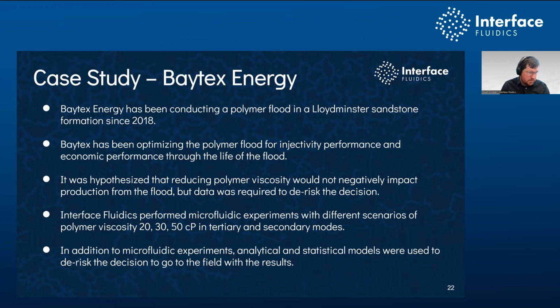The way we customize that is by modifying the pore throat sizes as well as the porosity. And then we apply pressure to the system by using high accuracy, high performance pumps. Similar to how you'd use pumps on a core flood, we've just got much fancier pumps that operate at much lower flow rates, with higher accuracy on both flow rates and pressure control. So we just use fancier pumps. So that's the questions that have come in so far.